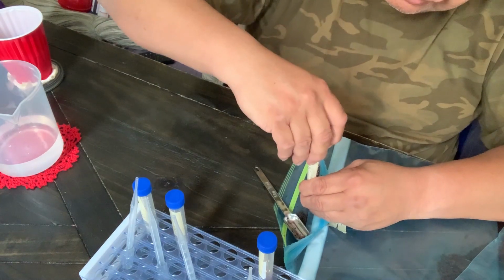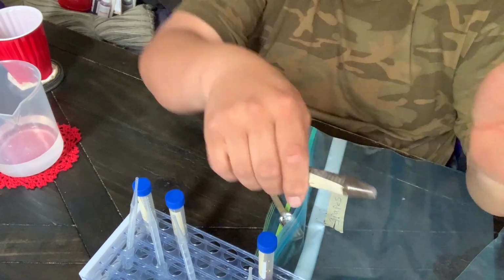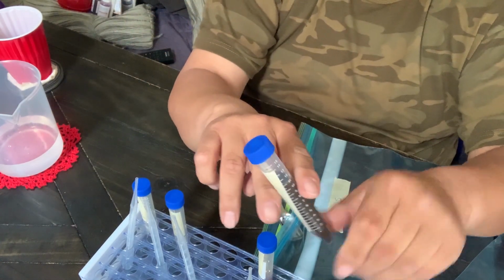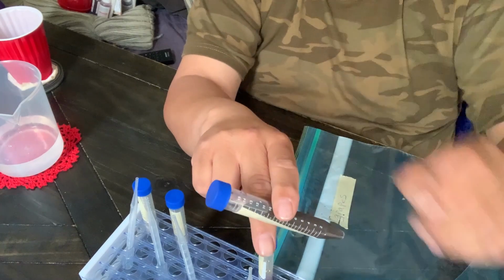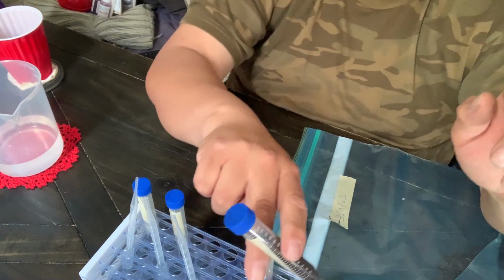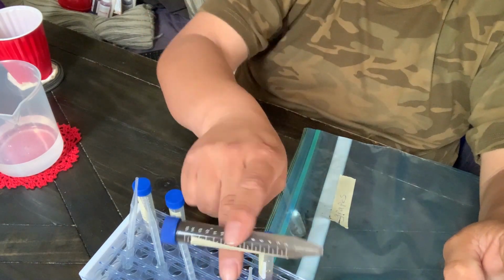Not shake again. Need to put enough water in there so we could gently rock it. So we want to get all this nice and mixed, all those loose particles in the soil. Now, the proper way is a gentle roll, like this. Because if you shake violently like this, you disturb and even damage the microorganisms. And remember, the microorganisms are very small. You need a microscope to view them. And if you do a violent shake, you'll just be destroying your specimen.